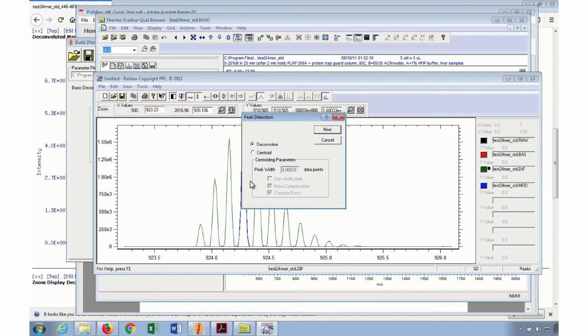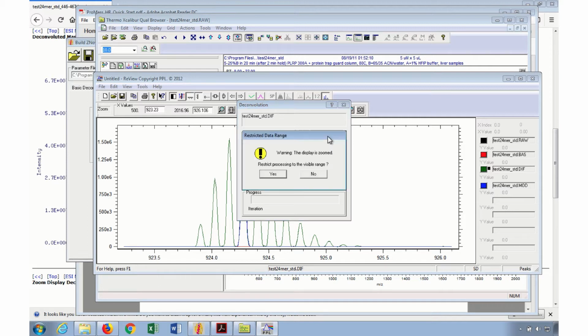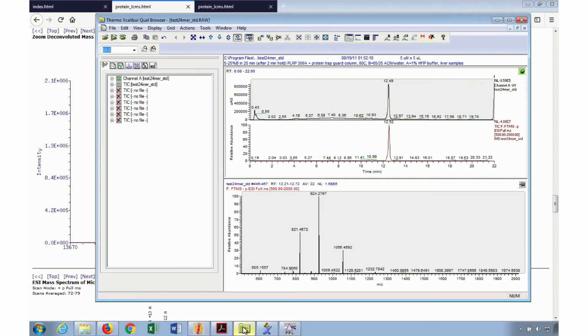Now the deconvolution here is not really charge deconvolution at this point, it's actually peak deconvolution. So it's going to take our model and compare it with the data and generate a deconvolution. So for this degree of fit, generally I select a value of 2, and this is printed in the guide, but I found that to be a more forgiving number. And I want to use the whole spectrum, so I want to say no to this. You do have to generate a model of your data.